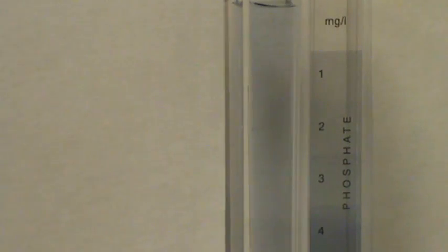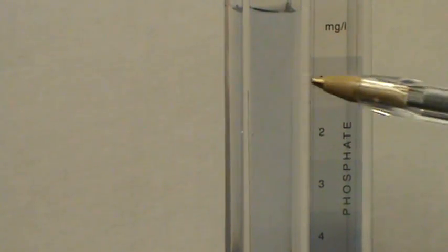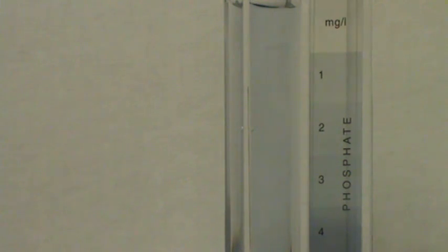I'll let you decide. I'm going to call it a number one because I believe that this is approximately the color of this number one. So for our first test here on the phosphates, it says did the sample turn color? Yes, it did. What did you get when you placed it in the comparator? I'm going to call it a one. If zero is low and four to five is high, where did our sample fall? It was one, which equals a low reading. Low is very good. We like low numbers when it comes to phosphates and nitrates. So we're going to call that a low rating.